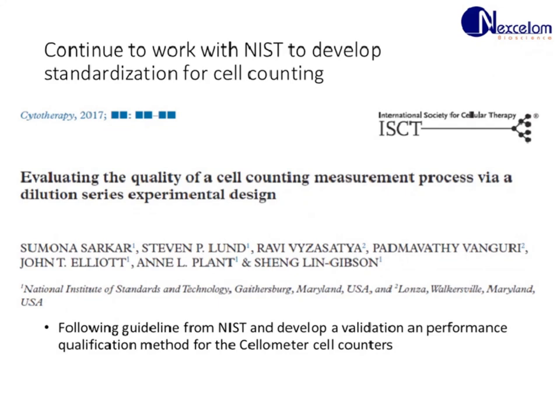So at this point, we are continuing to work with NIST to develop standardization for cell counting. They have already published a paper on how to qualify cell counting measurement. So we're now working with them on utilizing their procedure to qualify our cell counting methods, as well as developing cell viability qualification methods, which are significantly more difficult than just cell counting because of debris, because of changes to cell morphology by Trypan blue, as we discussed earlier in this presentation.